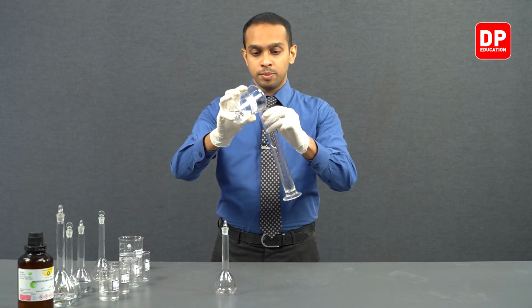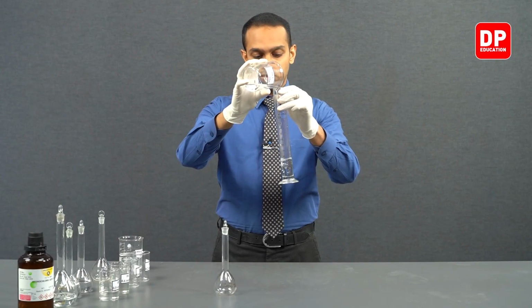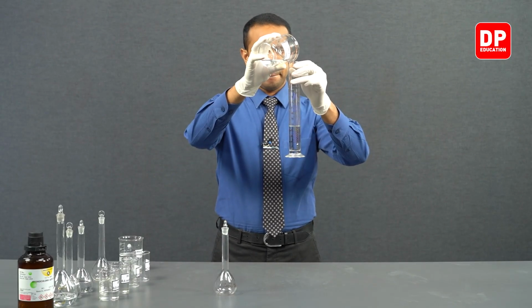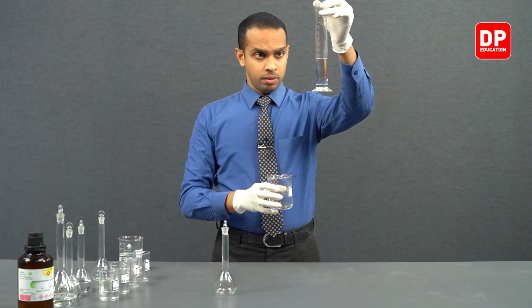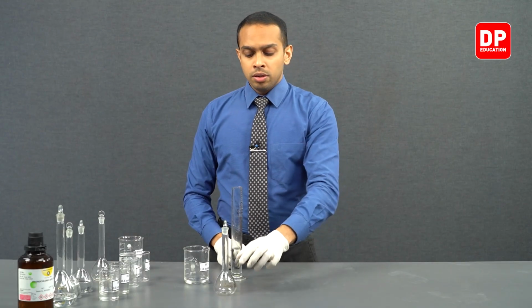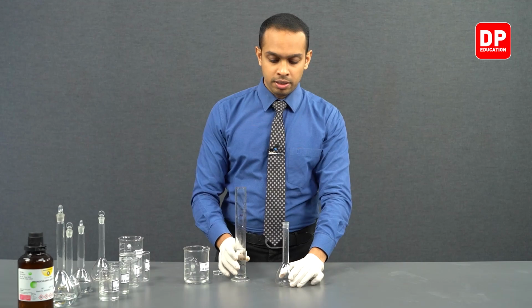Let's measure 40 milliliters of this solution. Now we have measured exactly 40 milliliters of this solution. We can transfer it to this volumetric flask that we have over here.